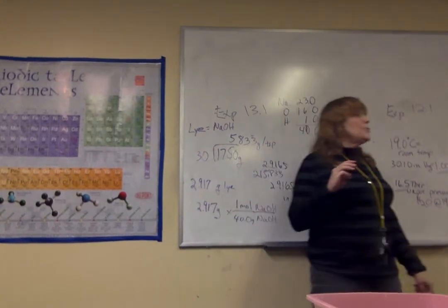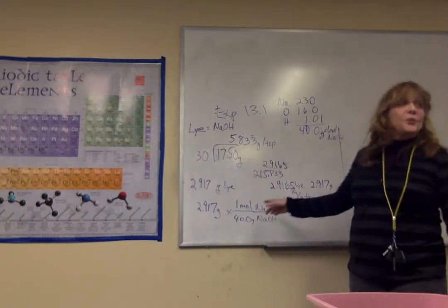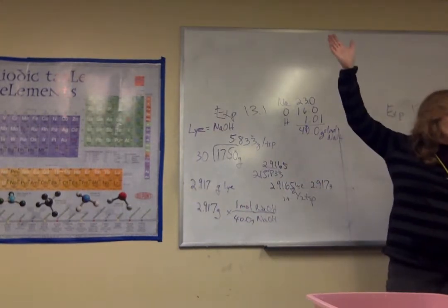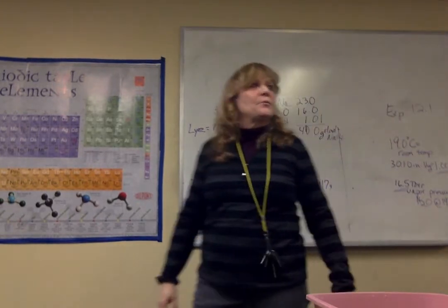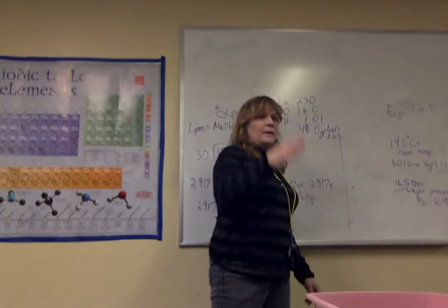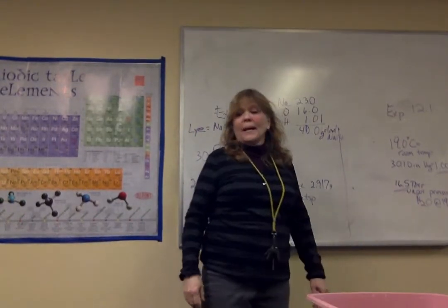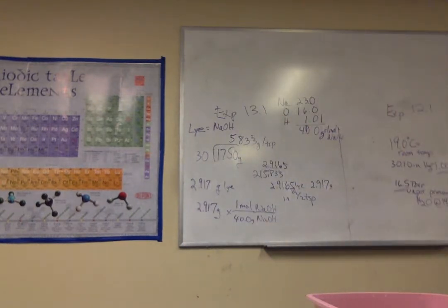You understand why with addition, right? This is going to round to 3 essentially. We're doing addition, so it goes by the decimal place. We have to round to the 1's decimal place. This is going to become 3 in essence. I added it to the vinegar, so we should have 102. So now you put that into your Q equals MC delta T and you calculate the Q. This is how you calculate the Q experimentally.